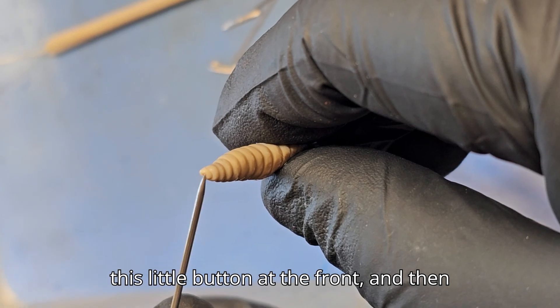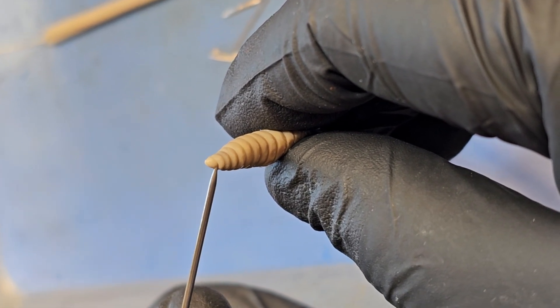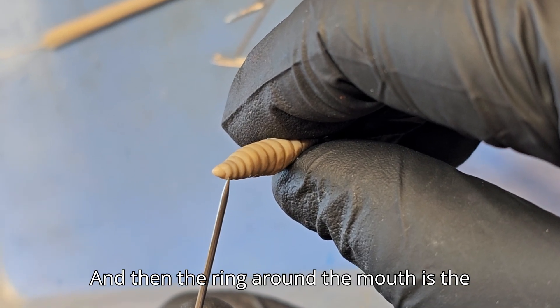Here we have the prostomium — this little button at the front. And then we have the mouth right there. And then the ring around the mouth is the peristomium.